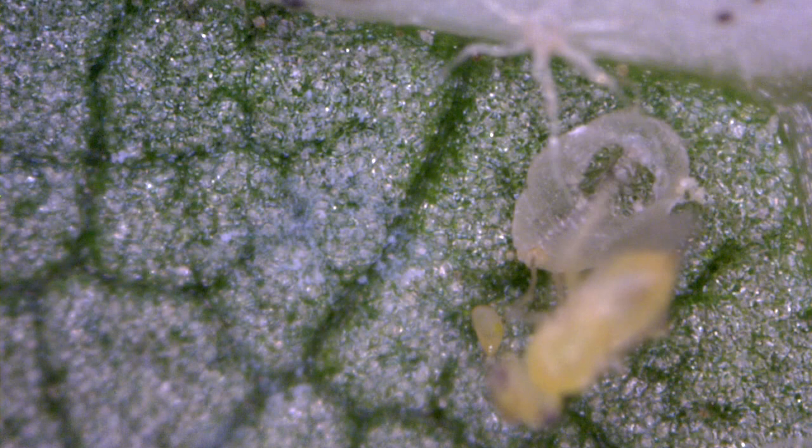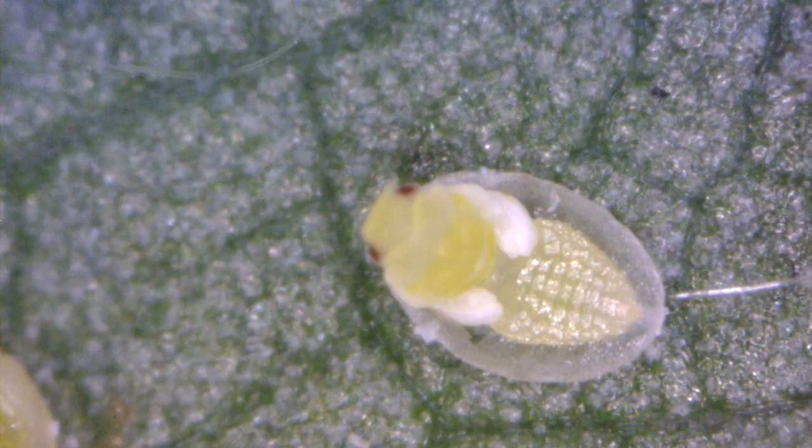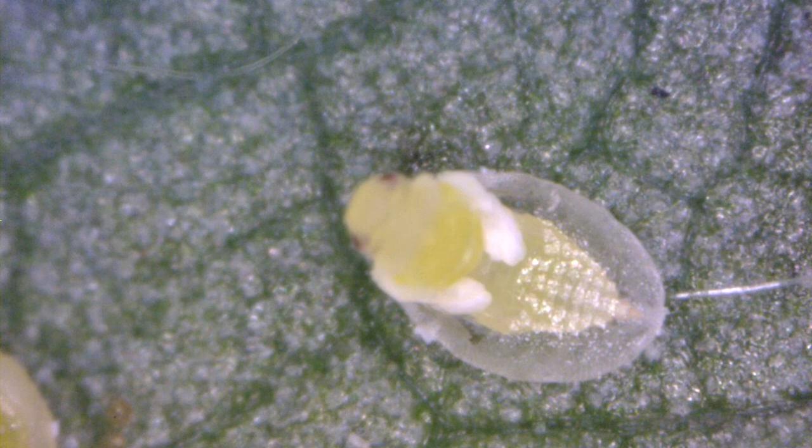The final evidence of parasitism is the circular exit hole that the adults leave as they exit the host. This is distinctly different from where a healthy whitefly emerges through a T-shaped window.